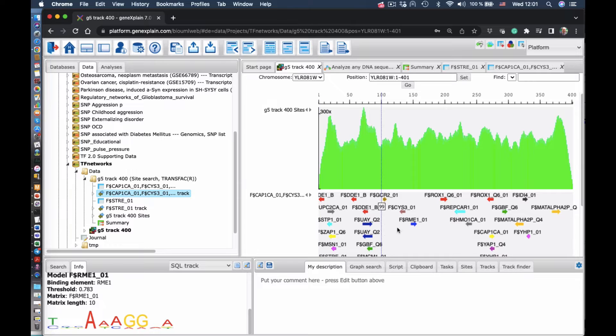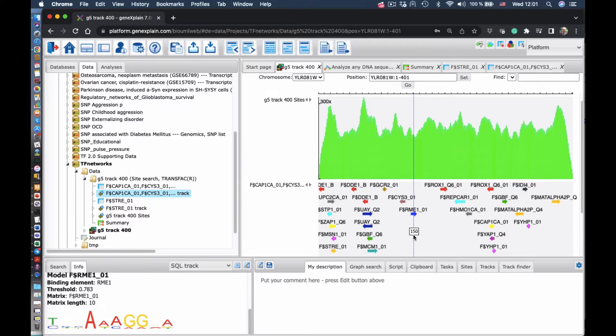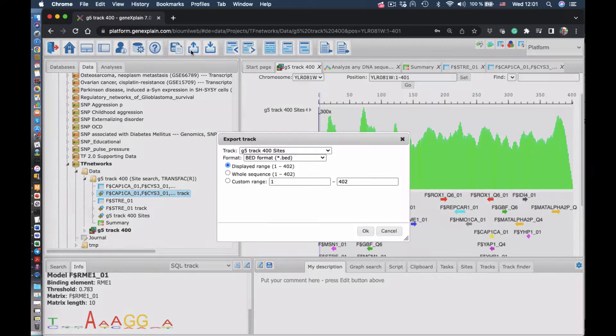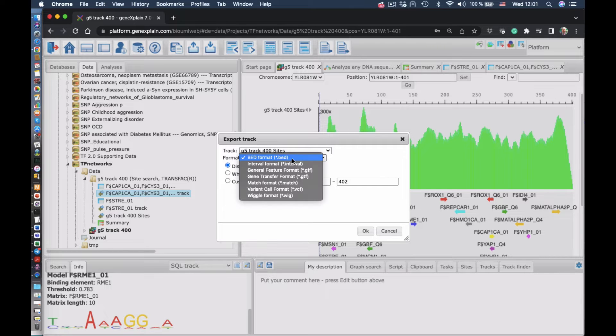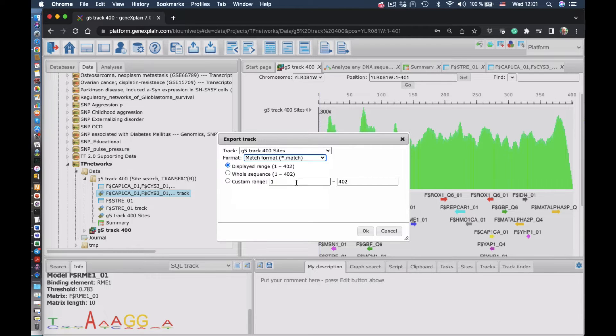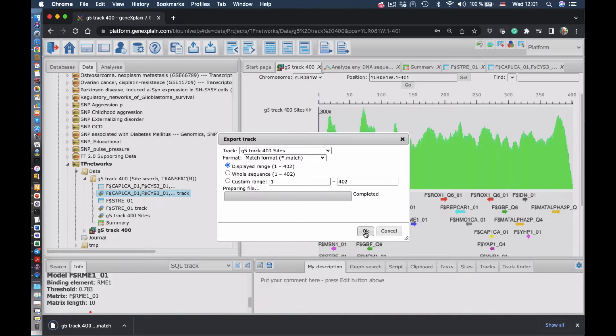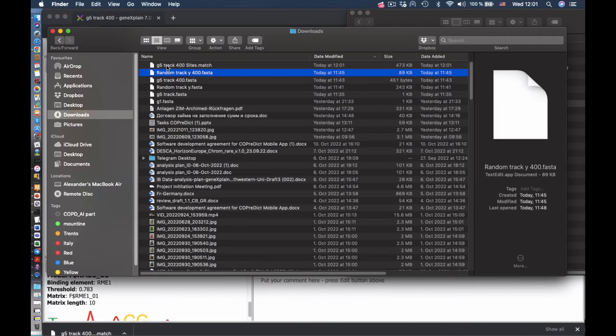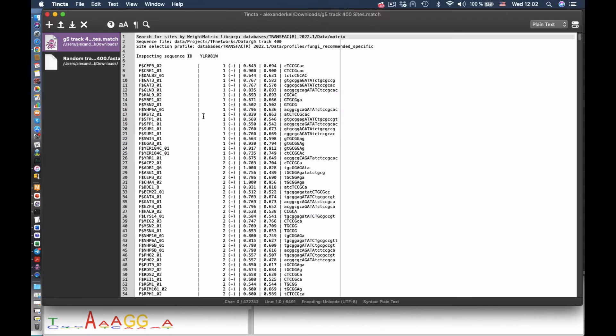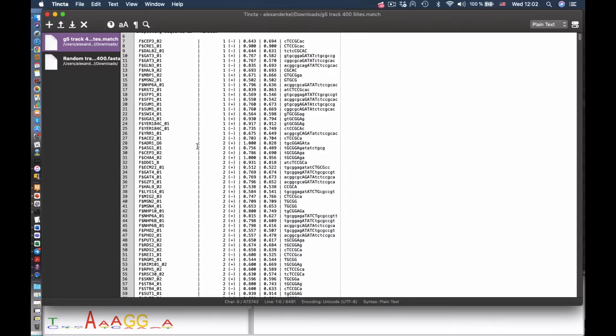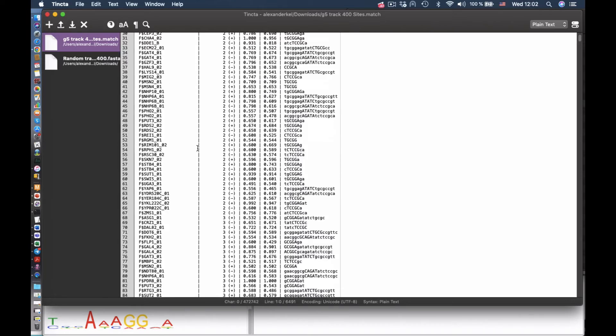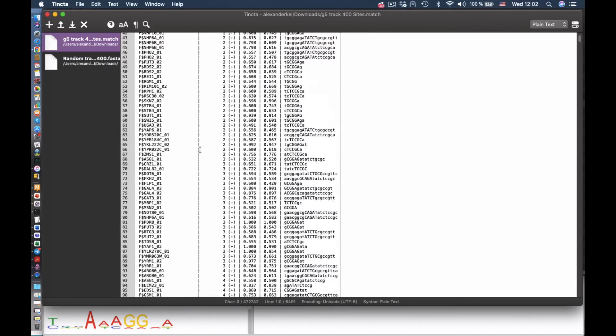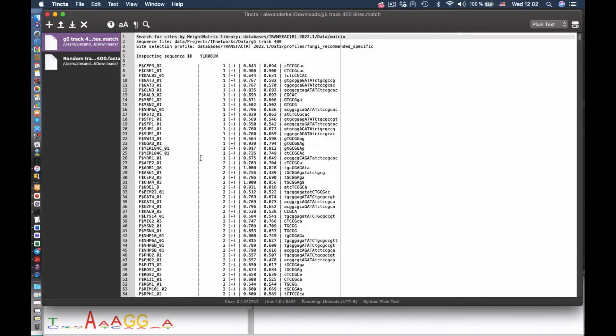We can zoom out and see the whole profile of the found sites in the promoter. And we can export it in this classical match format, which is a flat file. We can see it now with those matrices found, the positions of the sites, their scores, and the consensus sequence.